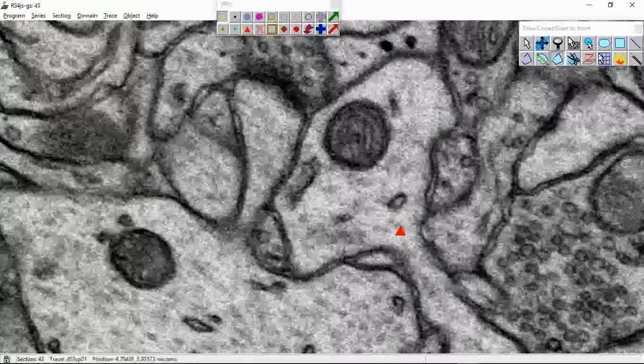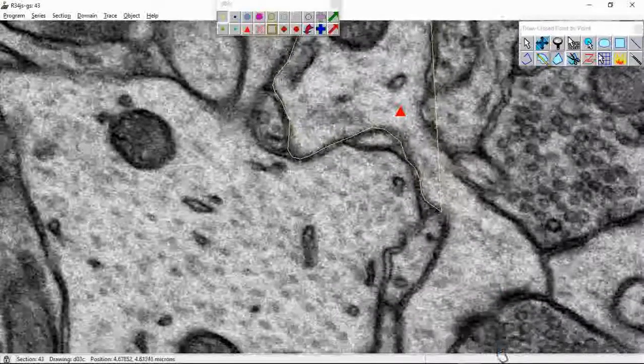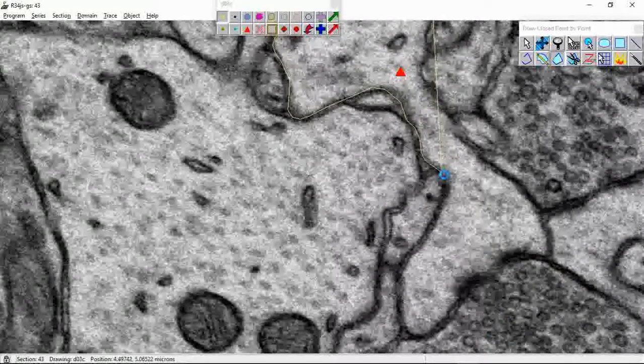So if I go up again, I can easily do this, and I'm going to go a bit quicker and a bit sloppier. That's because I want to show y'all how to make the 3D reconstruction that you'll be including in your lab reports, and if you work in the lab, potentially in a published paper. So we're going to continue.